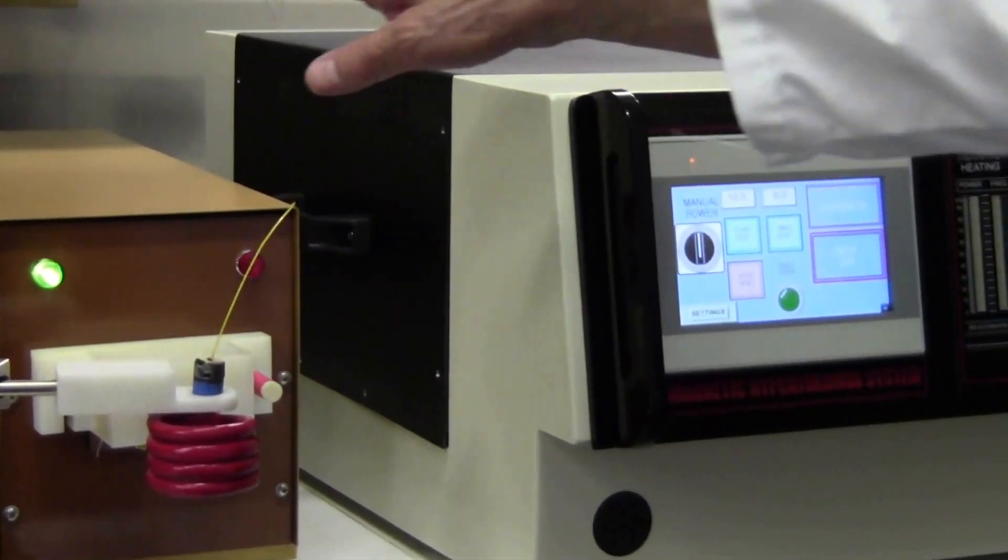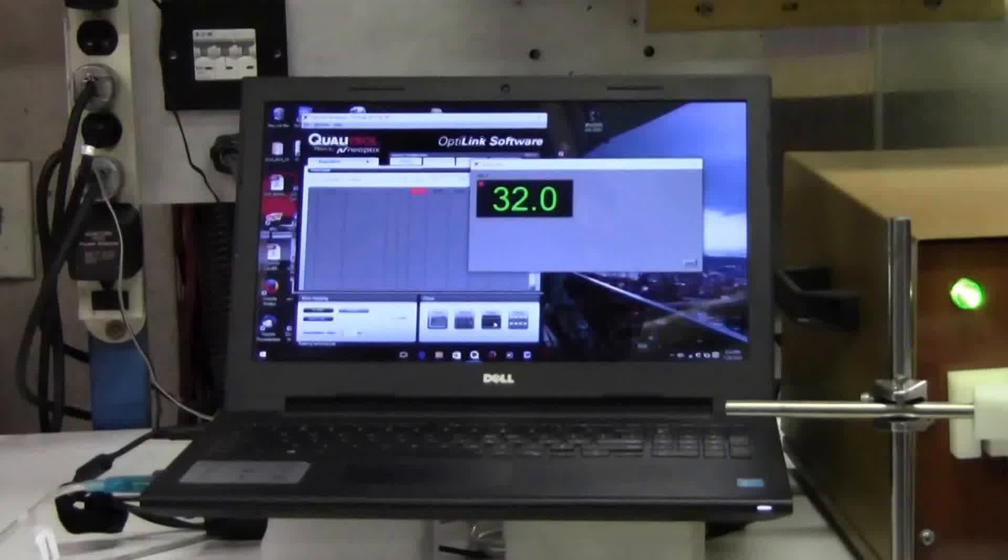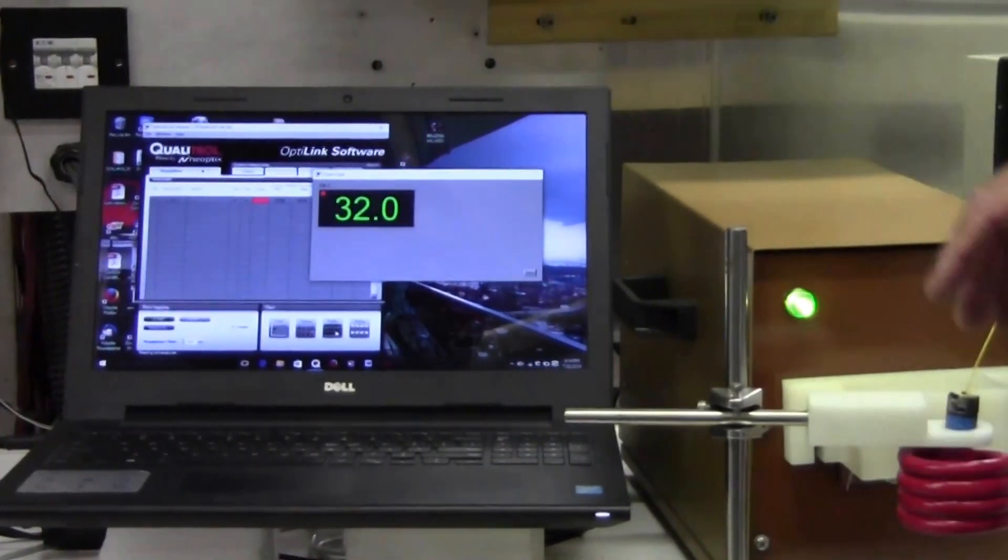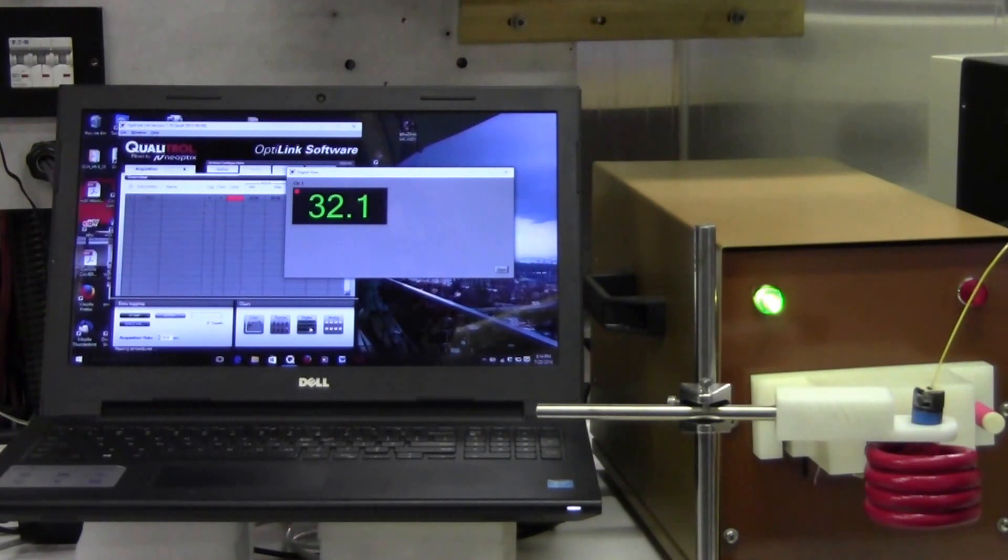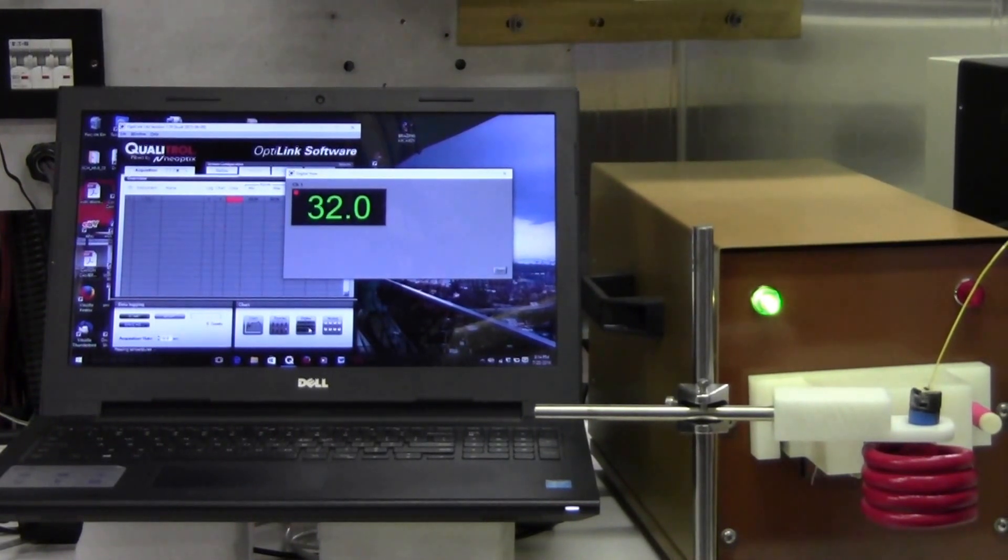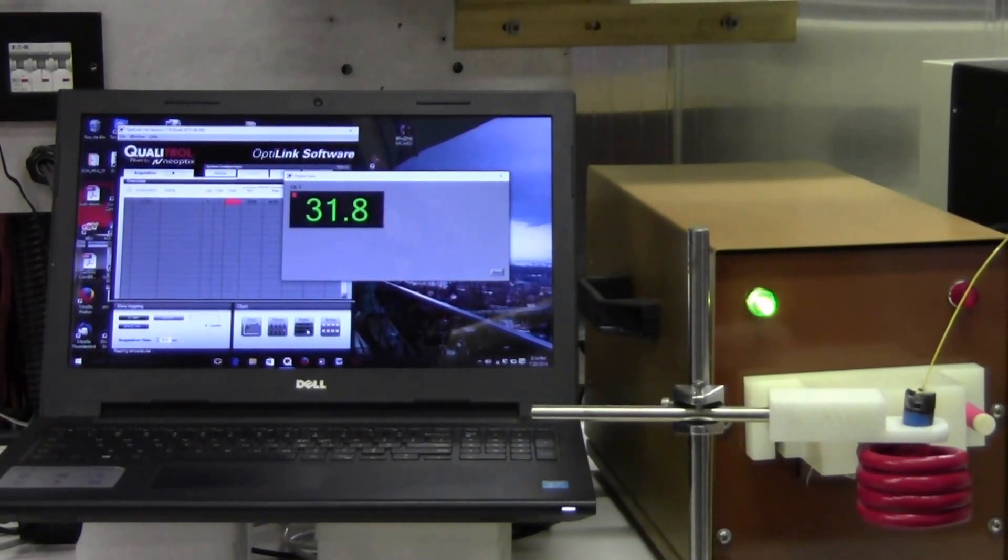Now if you scan over by the laptop computer, which is hooked up to the fiber optic temperature sensor, you can see we're currently at 32 degrees. If I step on the foot switch to heat again, you'll see the temperature start to rise.